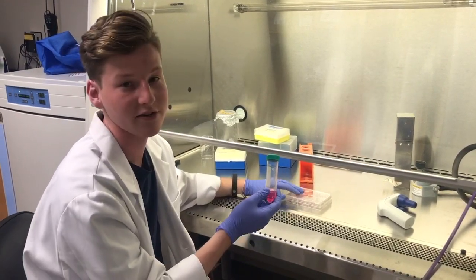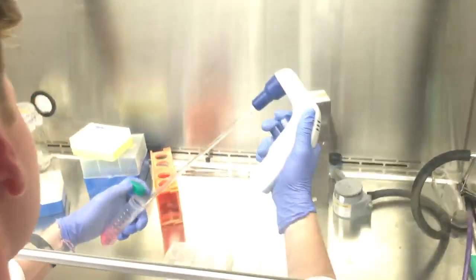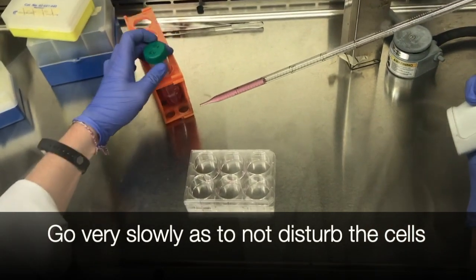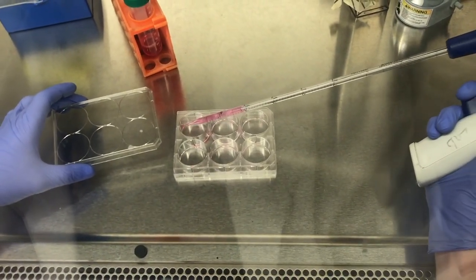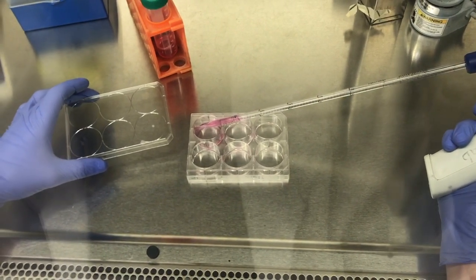Also, if you're using any drug treatments, they will need to be added in low serum media so you can let it sit overnight or for however long you need. Be very careful when putting the media back on the plate — if you do it too fast it could disturb your cells and ruin the scratch assay. Don't touch the bottom of the well, go very slowly, and it may help to dispense the media onto the side of the well.